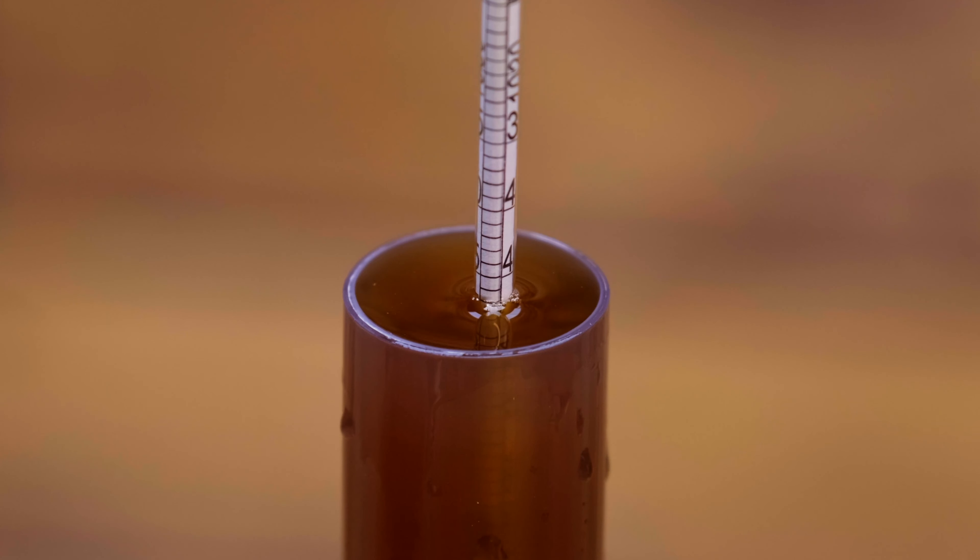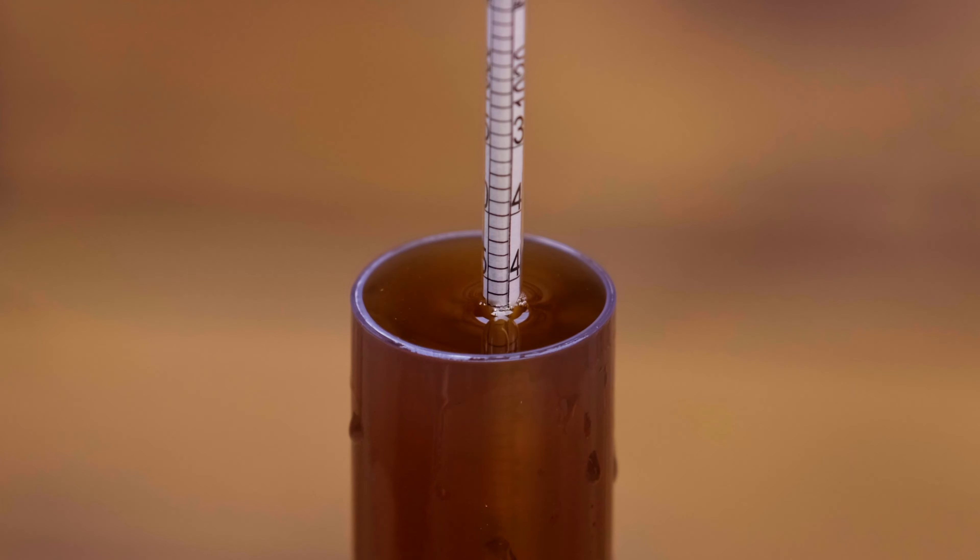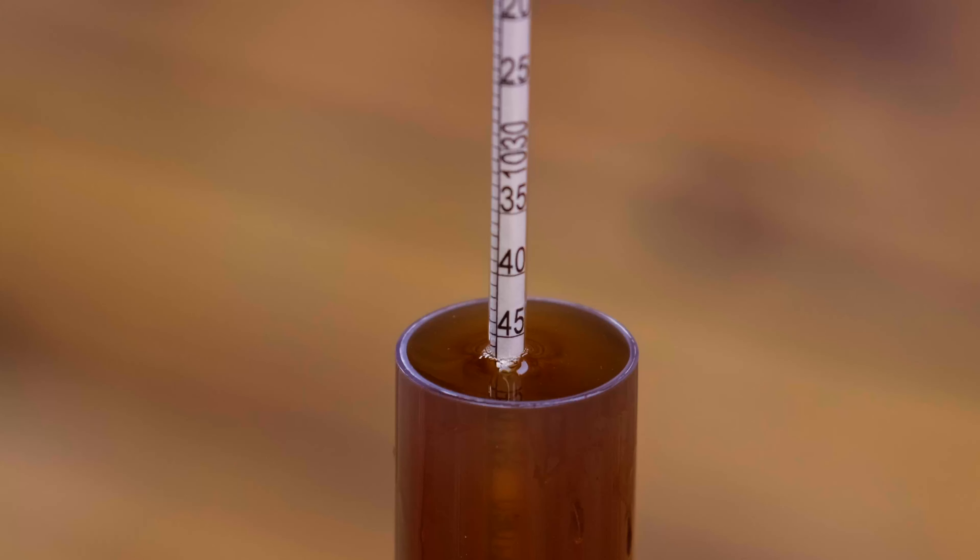Now you'll notice where the hydrometer sits in the trial jar, the wort actually licks up the side of the hydrometer. We want to ignore this — it's almost like we're measuring a flat surface across the trial jar. In the example here, you can see we could easily take this reading at 1046, where an actual accurate reading is 1047.